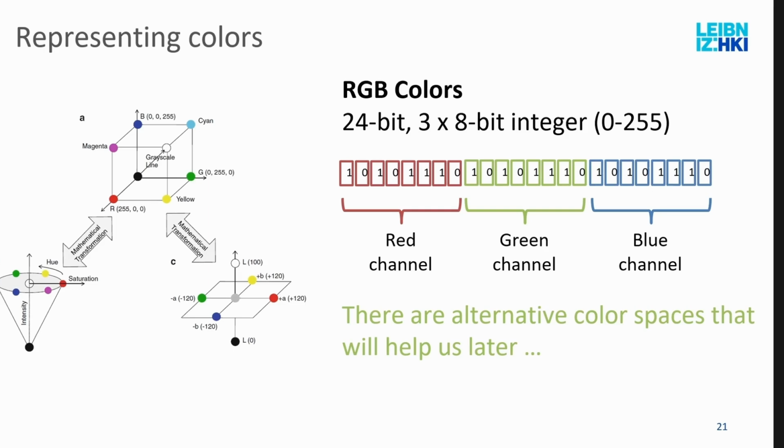For images that have transparency, if you take an additional 8 bits and add it on top, they use this for the alpha channel, so for the transparency channel. But ImageJ cannot handle transparency, so it just ignores this additional space that it usually allocates for itself. It makes no sense to limit yourself to 24 bits, because of custom hardware. It is faster to work with 32-bit than with 24-bit in computer hardware.